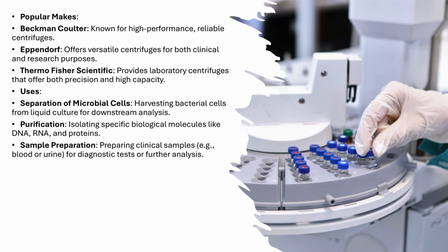Some of the top brands for centrifuges include Beckman Coulter, Eppendorf, and Thermo Fisher Scientific. These brands are known for providing high-performance, reliable centrifuges for both clinical and research purposes. Centrifuges are indispensable in microbiology and clinical settings. Here are a few key uses of a centrifuge in microbiology labs.